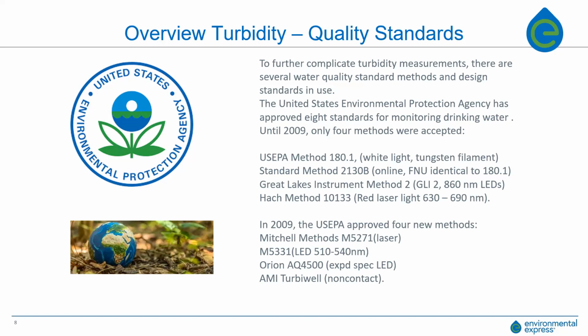Taking regular turbidity readings can optimize your bed performance by establishing efficient filter backwash cycles. So they know approximately when that filter bed needs to be backflushed and regenerated, so to speak. And in the case of filter breakthrough, turbidity readings can indicate the breach of the particles before it becomes a really costly problem, and they need to shut down that filter bed and essentially rebuild it.